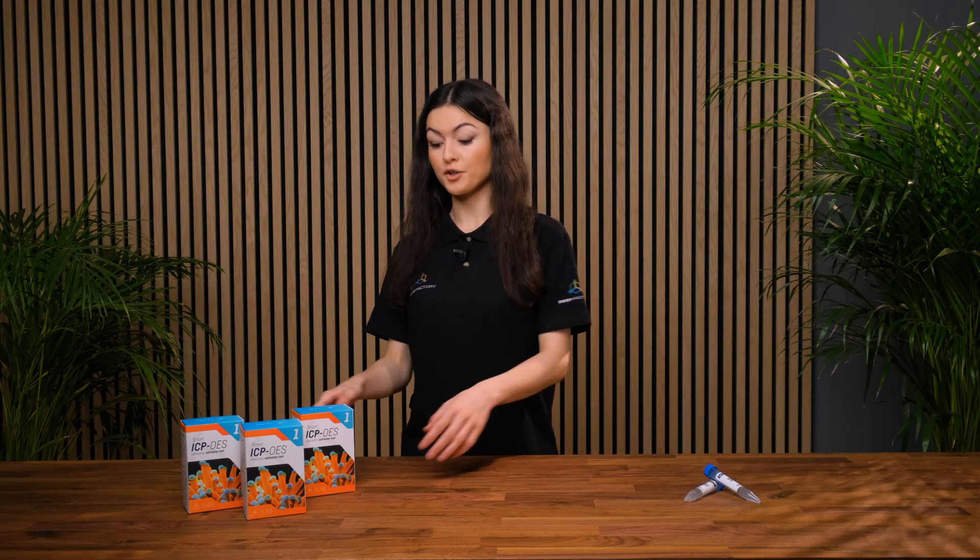Hello there, I'm Monica from Reef Factory. Today I'm going to show you our new product called Smart ICP-OES.